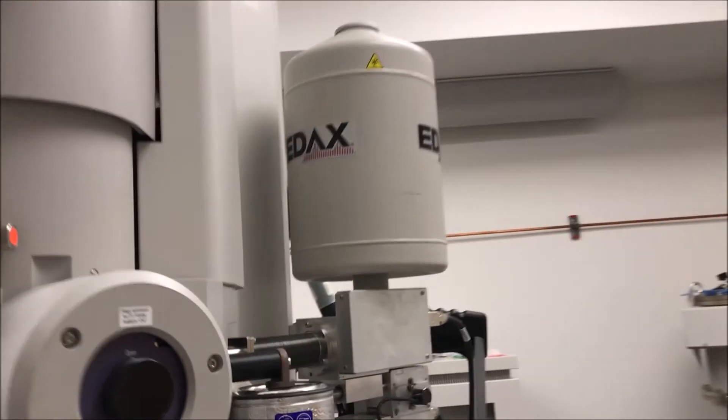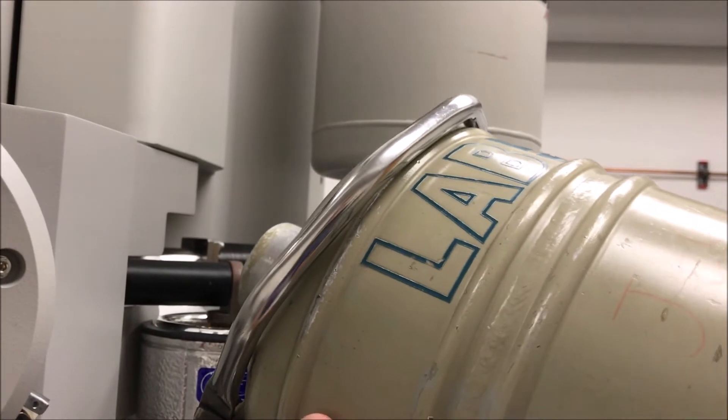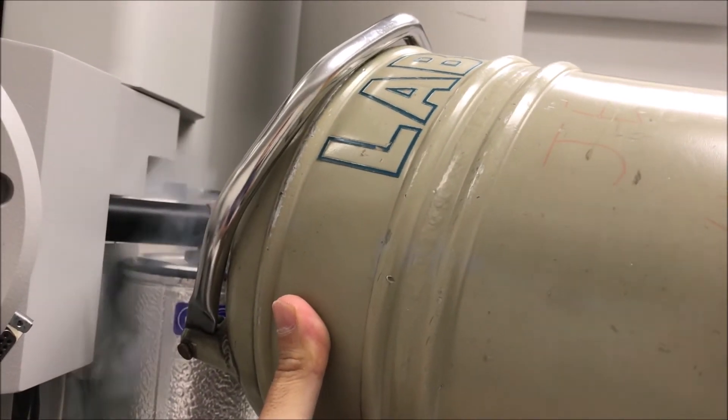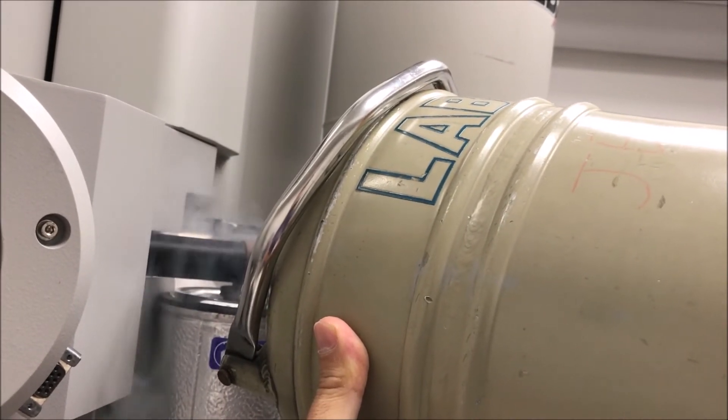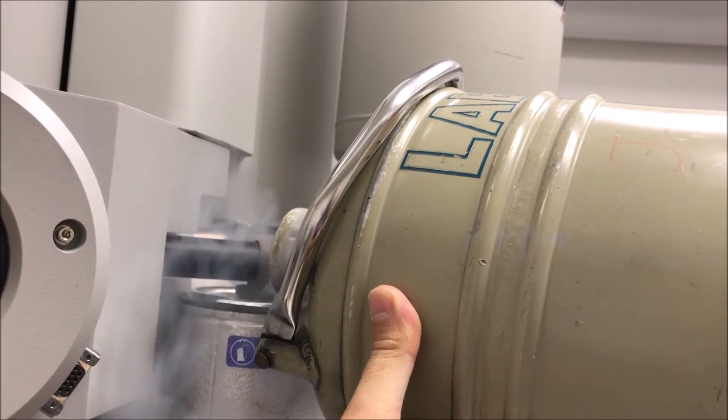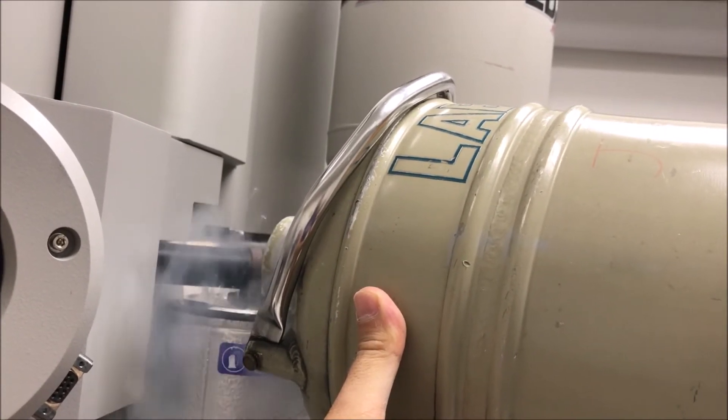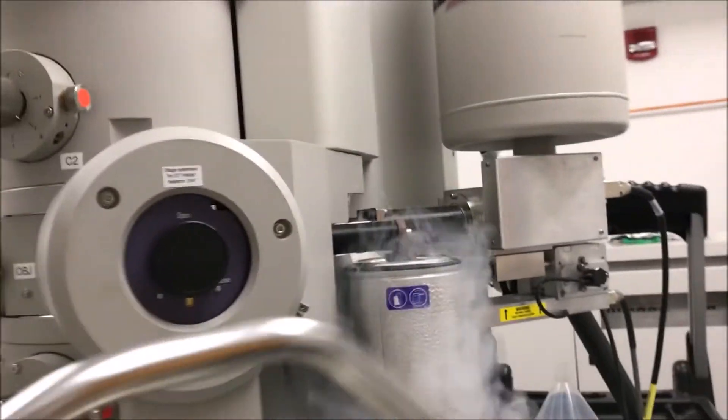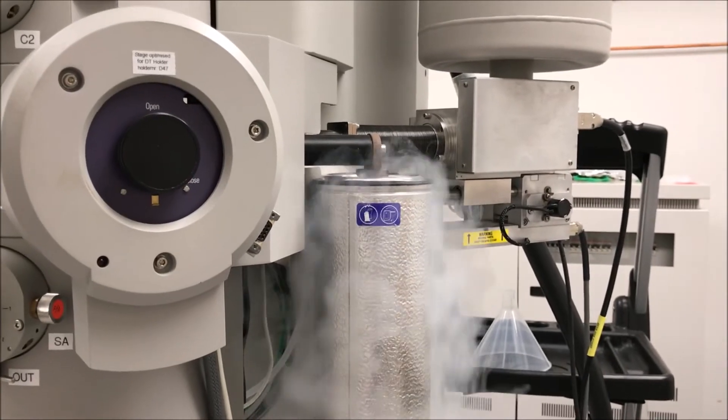Then you need some liquid nitrogen. I have some already here in a separate dewar. You're going to fill up the canister. Make sure the canister is already on the support base with the copper braids inside. You don't want to fill the canister first and then put it up there. Fill this all the way to the top. If you spill a little bit, that's not a problem because you have the viewing screen covered. Now we're going to wait about five minutes and then fill it up again.